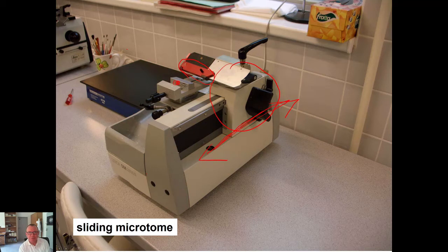So this movement forward and back is the reason why the microtome is called sliding.